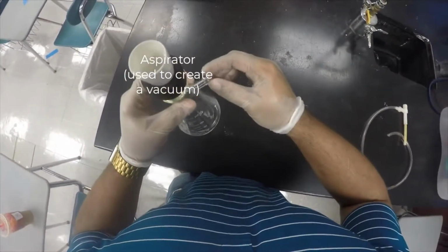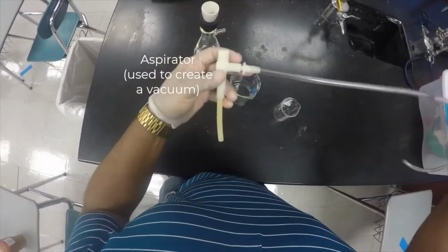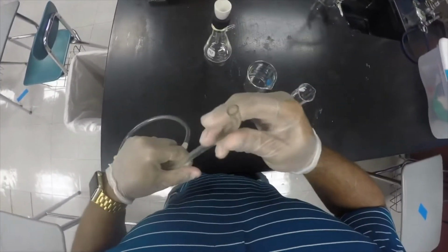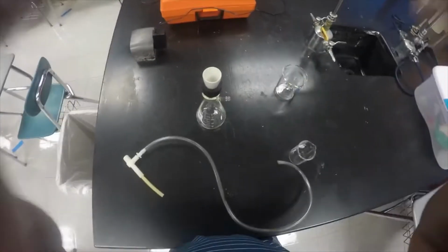This little arm sticking out of the side goes to something called an aspirator. The aspirator is a device that when you connect it to the sink, it creates a vacuum. I can try to turn this camera so you can see how it all fits together.